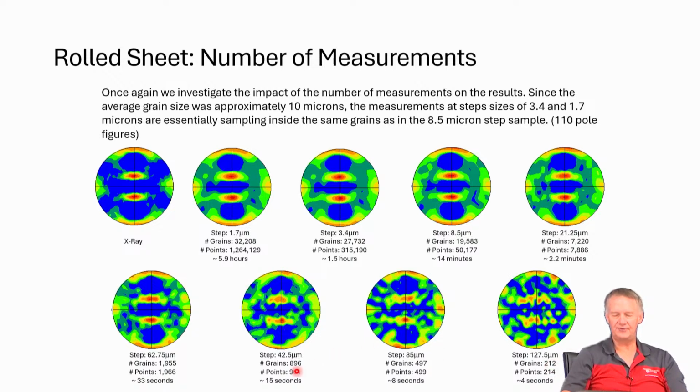You get above 1,000 or so, so that's close to 1,000. This is close to 2,000. As soon as you get somewhere above 1,000 or so, they start to be reasonable intensity. Again, it's maximum of about 4 times random, right? 3 times random, something. So similar to what we had on the last representation. This is just showing a different texture, with the rolled texture instead of the single fiber that we were looking at.